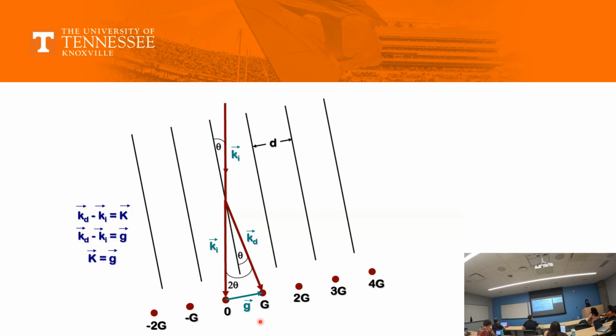You call the center 0, and then you go from plus G to minus G. When I am on the microscope, I will ask you, please, could you go from plus G to minus G? I am literally doing nothing: from my image I press D to get the diffraction pattern, go from one diffraction spot to another, go back to the image and take the image. Ultimately I want an image that is parallel to your G's. You want images at different G. So this is exactly what is happening.